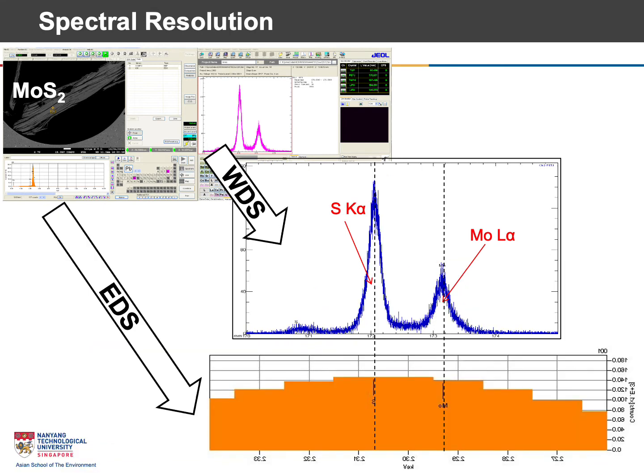Now here is the same result. To make it clearer, I zoomed in on the energy spectrum from EDS. Basically there's no telltale sign where we can resolve the energy spectrum. Probably somewhere here they overlap. So again, it depends on what we're trying to do. One of the techniques is much better than the other in certain cases.